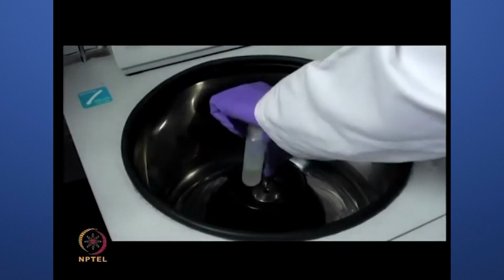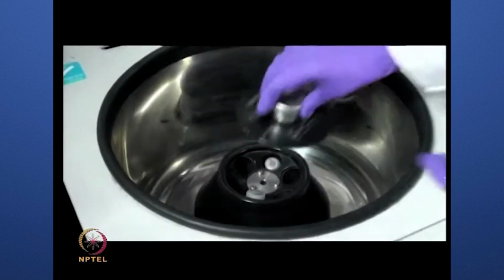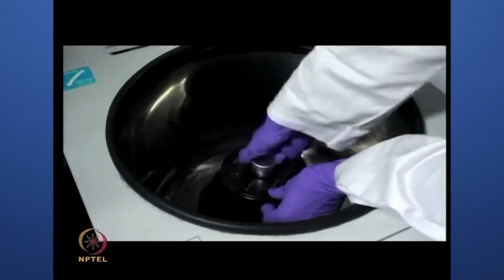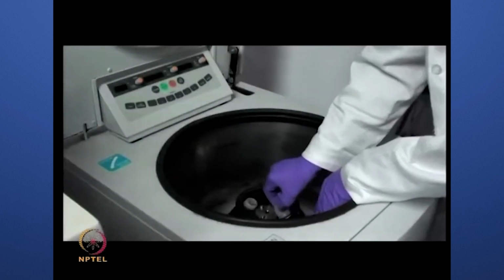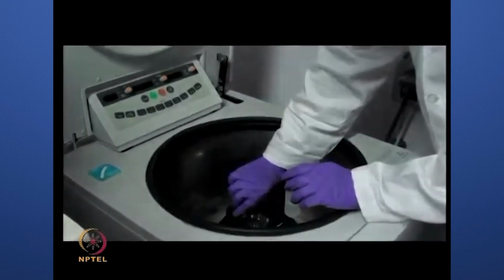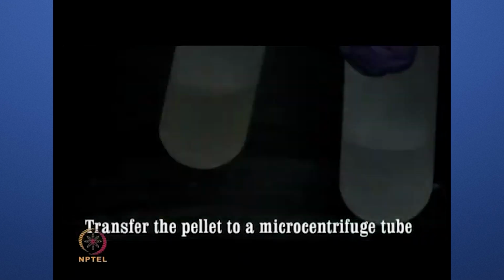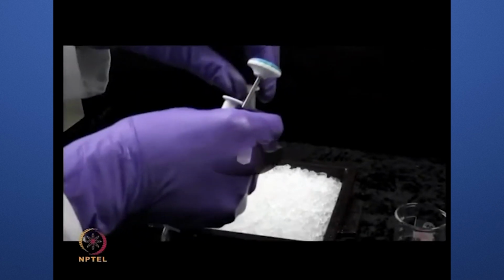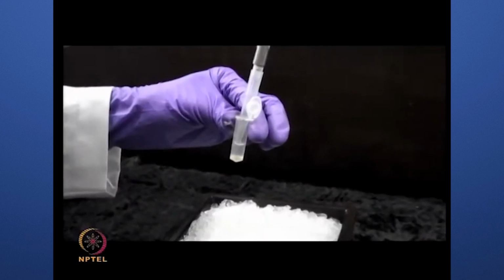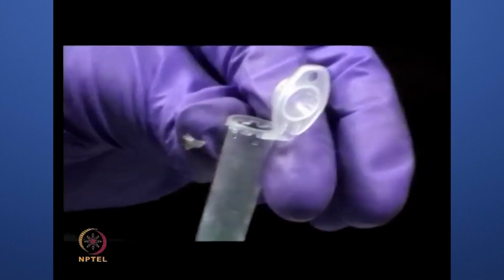Centrifuge this tube at 12,000 rpm for 10 minutes, maintaining a temperature of 4 degrees Celsius. Transfer the pellet obtained containing intact bacterial cells to a fresh microcentrifuge tube. Wash this pellet thoroughly with phosphate buffer to remove any unwanted debris.